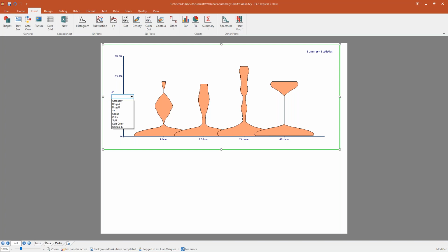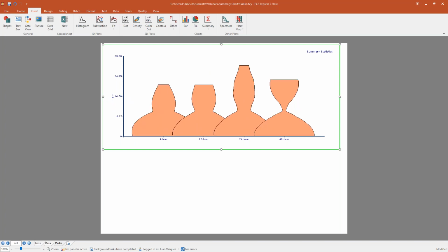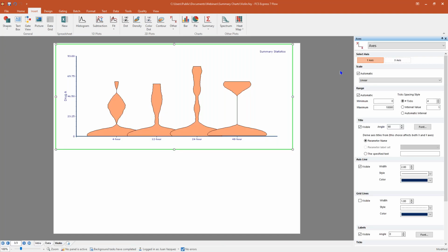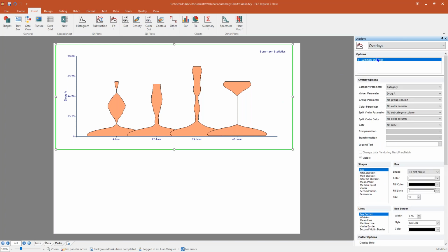So we're looking at the response from one drug or another, or some other type of stat that's being used as a representation. Again, from our Format tab, we'll still be able to format this plot like any other object. But we're going to access the full functionality of this plot, again, from the Overlays category, much like we did for the Box and Whiskers and Levey Jennings plot.